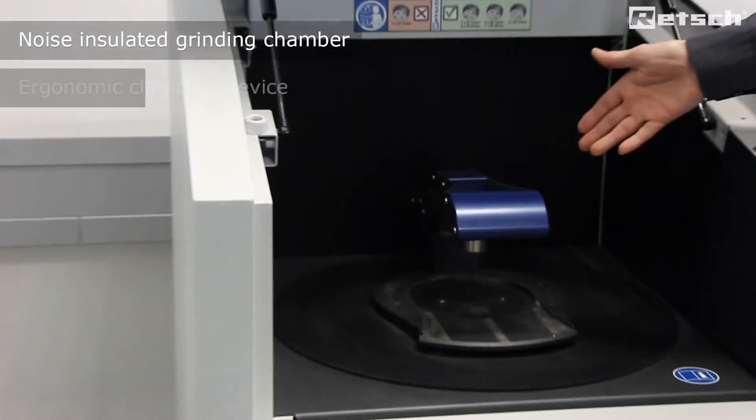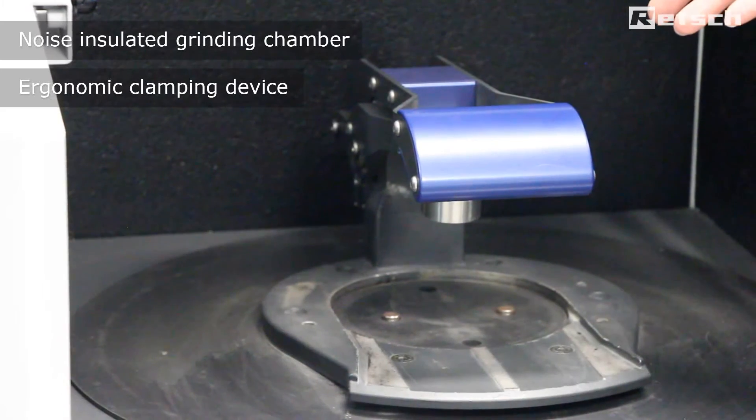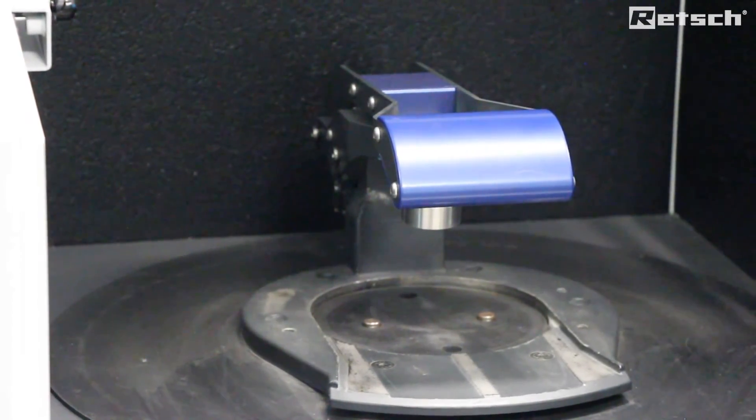The instrument is also supplied with an ergonomically designed clamping device for clamping the grinding elements. Furthermore, the instrument is supplied on four casters, the front two of which are lockable.